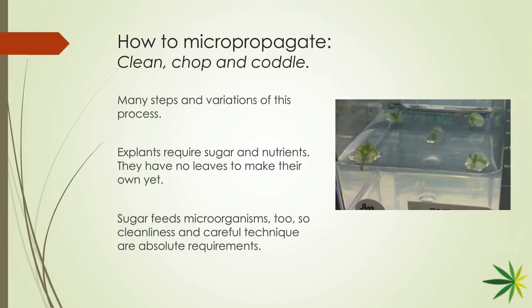Well, absolutely, yes. If you're storing plants this way, you are still going to have to occasionally do a process that I call subculturing, the common method where essentially you would just take the same material, chop it up, and coddle it again. So indefinitely is the answer. Now when it comes to genetic degradation, that's a different story. Mutation in plants stored this way is extremely rare. You're not really disrupting the plant at a cellular level. You're not doing anything to cause mutation.